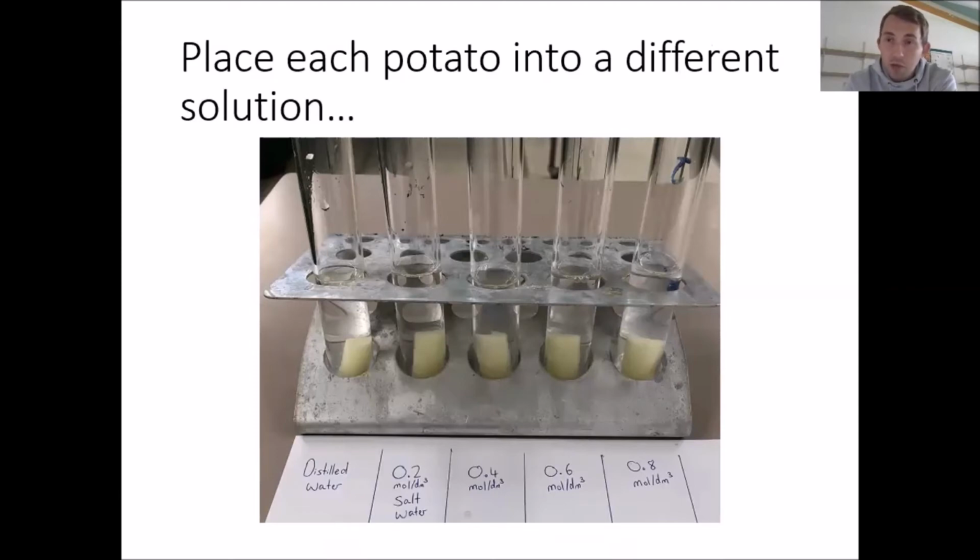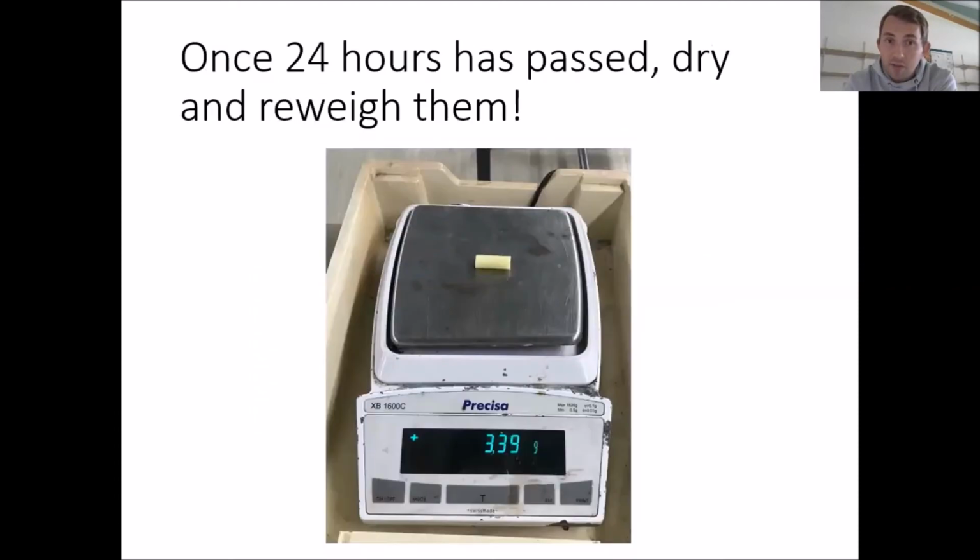And what you do is you leave it for 24 hours. And after 24 hours, you will then reweigh the potato and see how they got heavier or how they got lighter. So you're going to be able to compare what has happened, and then we're going to do that next lesson, explain what happens. So next lesson, we'll do the science behind this practical. So you can see it's a really exciting practical you're missing out on, but I try my best there to recreate it for you in this video.